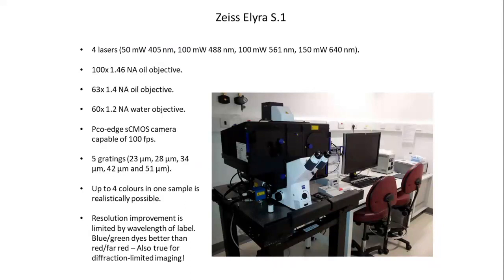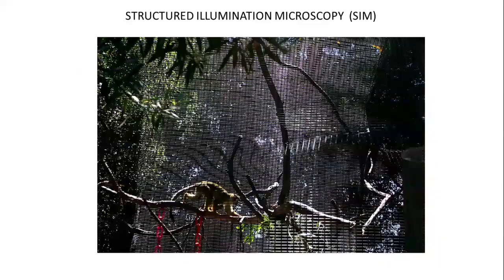And how it works is this. So here's a picture from some zoo or other. This is a cage where you've got a grid-like sort of barrier at the front of the cage and another one at the back. And when you look through both of them, the grid of the one interferes with the other, and you start to see these sort of darker lines. So that's basically a form of mixing. We're just looking at one grid through another grid, and we end up generating this low frequency information here, these dark lines.